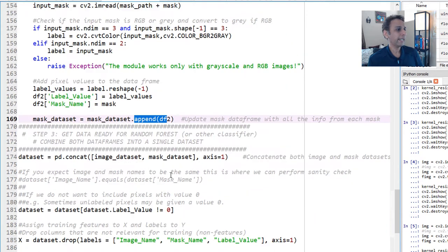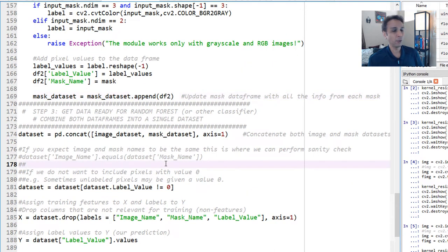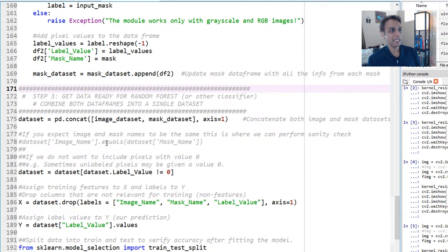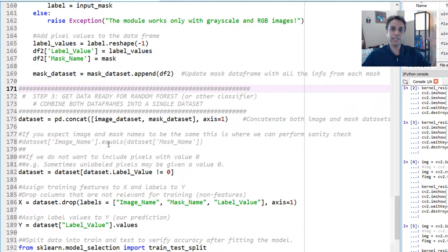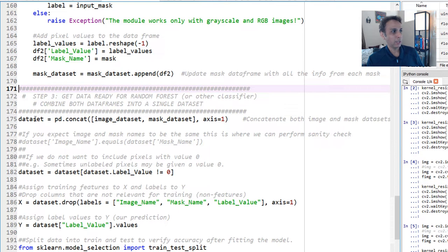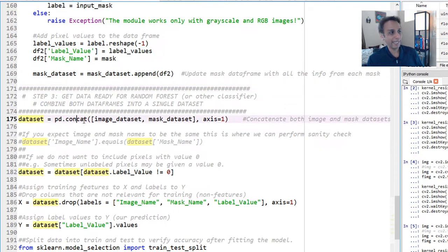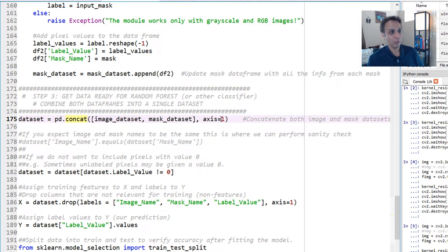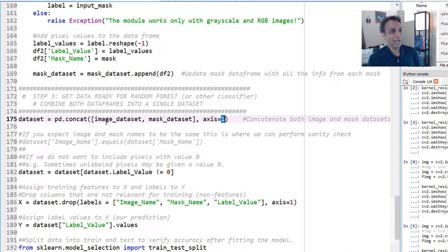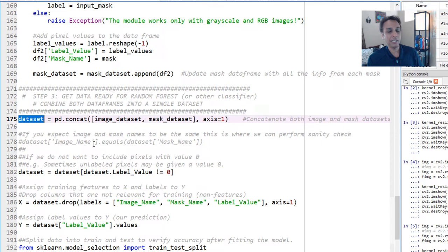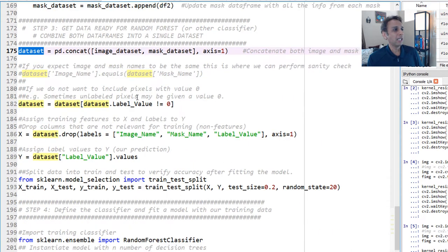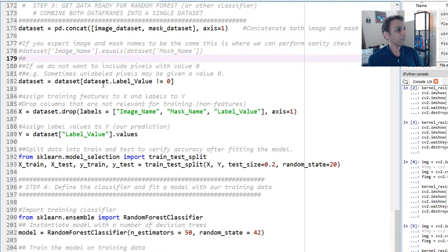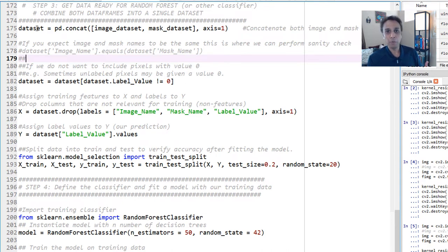Probably using functions would be a better way, but for loops is not bad. So the next step, now that we have our mask and images ready, we have to put all the information into one data set. So that's exactly what I'm doing. So get the data ready. So I'm creating a new data frame called dataset, where I'm concatenating, which means you can concatenate rows, meaning add the rows, or add columns. So my axis equals to one, that means concatenate along the column path. So it's going to put this image data set and mask data set together and create a master data set. Memory-wise, this is probably not a very efficient way of doing things, but it should be fine on most systems. Now that my data set is ready, I think I'm almost ready.